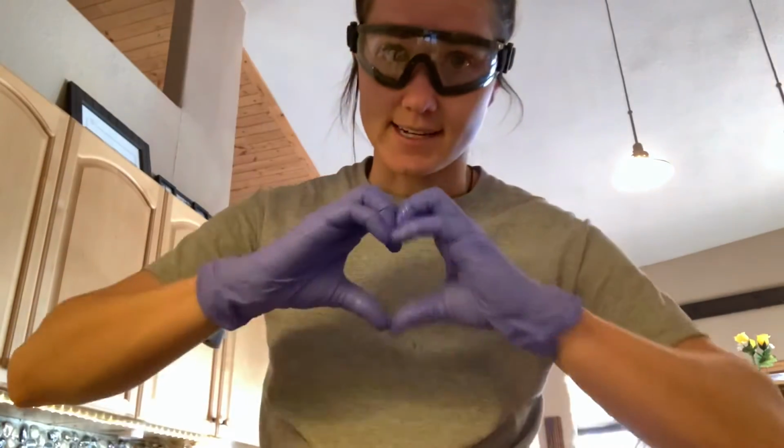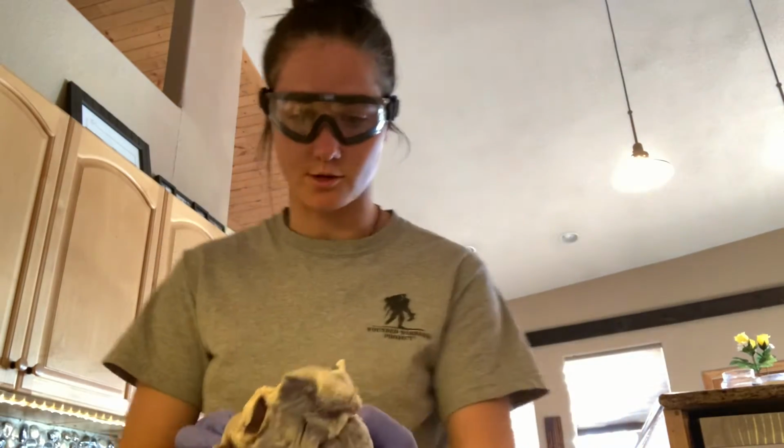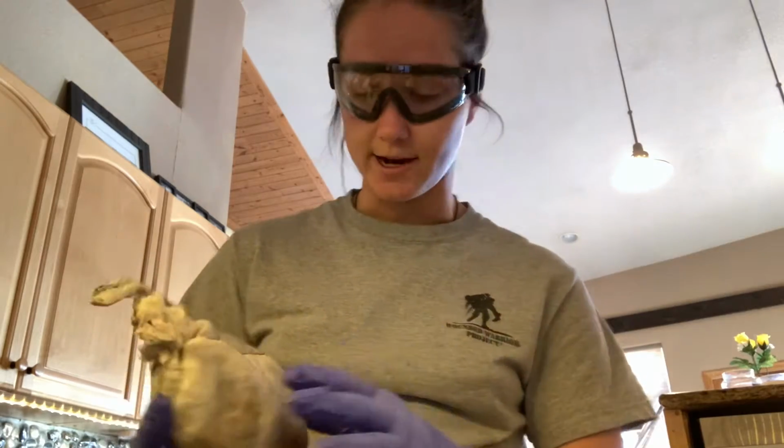And today I dissected a sheep's heart. So let's dive in. I'm sure you've seen 100 of these so far. All right, so here's our heart. I'm going to first go over the 3 layers of the heart.